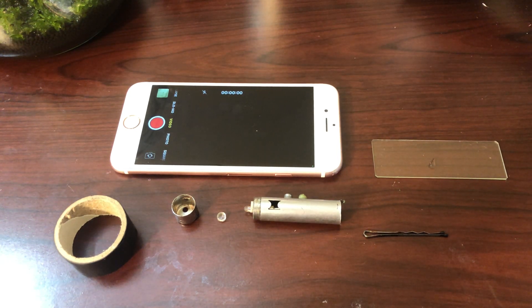Hi everyone, Ryan from Avatar Aquatics. Today I'm going to show you how I make a DIY microscope using just the materials seen here.